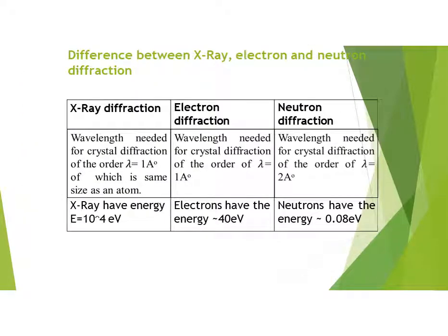Let us discuss how the low energy electron diffraction microscope works. A beam of electrons of well-defined low energy is incident normally on the sample. The energy of the beam may range from 20 to 200 electron volts. The diffracted electrons can be observed on a fluorescent screen after energy filtering grids, which select only the electrons with the same kinetic energy as the primary electrons.